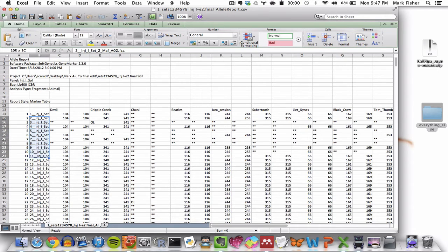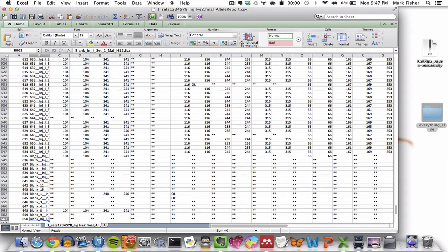So remember that if we put any of these numbers, right, 1, 2, 3, 4, 5, 6, 7, 8, whatever, in the rejected samples list, it gets excluded from the relevant analyses in the pipeline. But in addition to that, actually blanks get excluded no matter what. So if any of your sample names have the word blank in them, they get excluded.